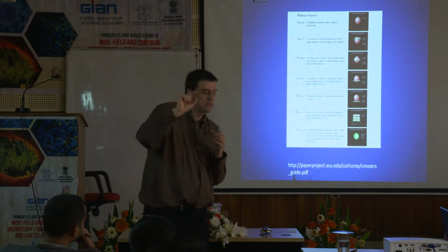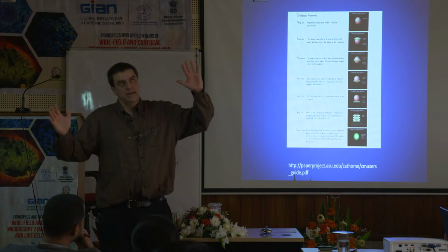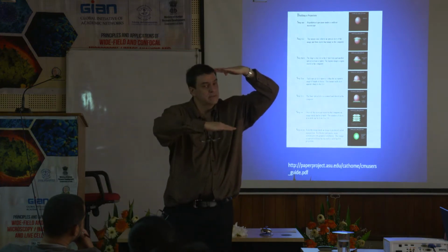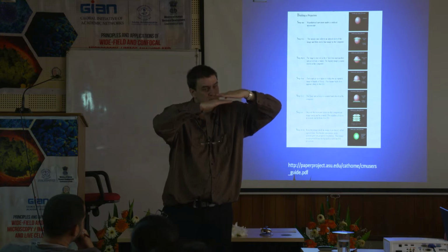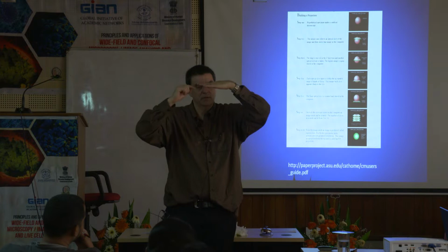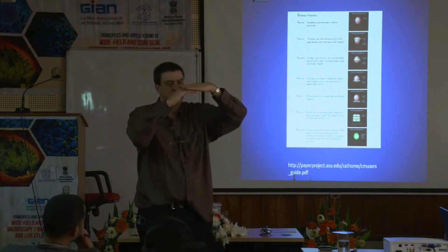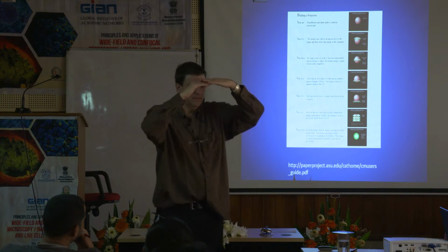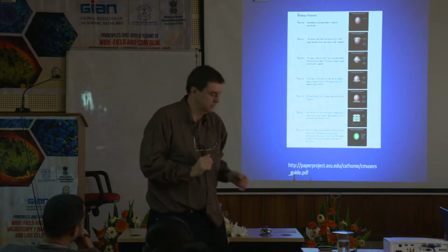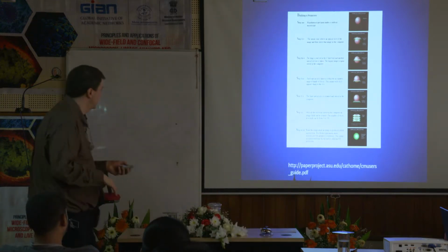The thing about that is the higher the magnification you use, the smaller your step size is going to be. Because remember what we talked about the other day. At 10x, this much is in focus. At 20x, this much is in focus. 40x, this much is in focus. Obviously if you have something this thin, you're not going to be able to move real far to get that overlap. So the higher the magnification, the tighter the step size. Does that make sense? It's an important concept. That was a very good question.